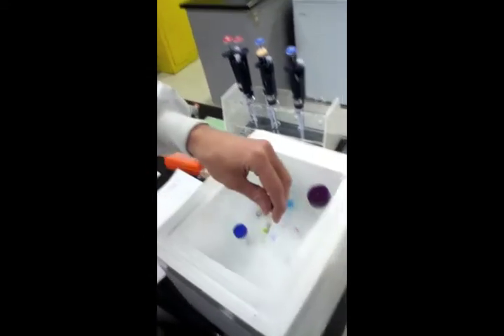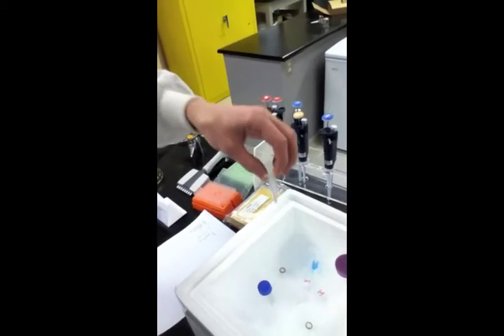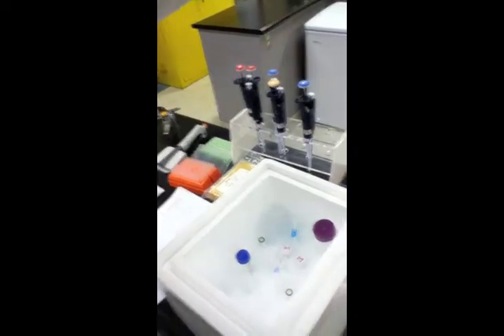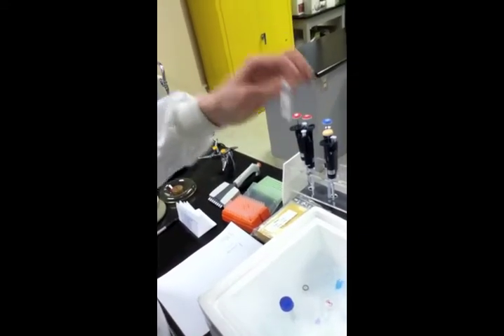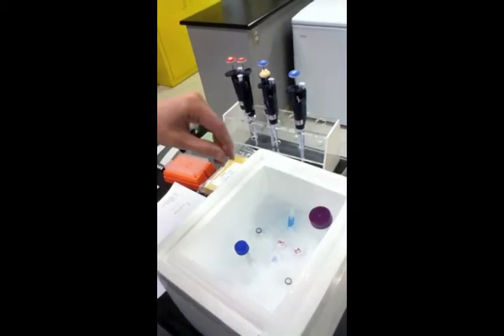Now this enzyme likes to live in a certain buffer, so we have a Taq buffer which provides all of the metal ions and exact pH and salts that this enzyme is most active in. Now if we're going to polymerize DNA, what do you need? Template DNA? Well, that's boiling over at the water bath way over there. But of course, the other thing we need is primers. We need a primer for both strands, the forward strand, if you will, and the reverse strand. These are DNA oligonucleotides that have been synthesized chemically, that Todd has ordered for this particular region of the genome.